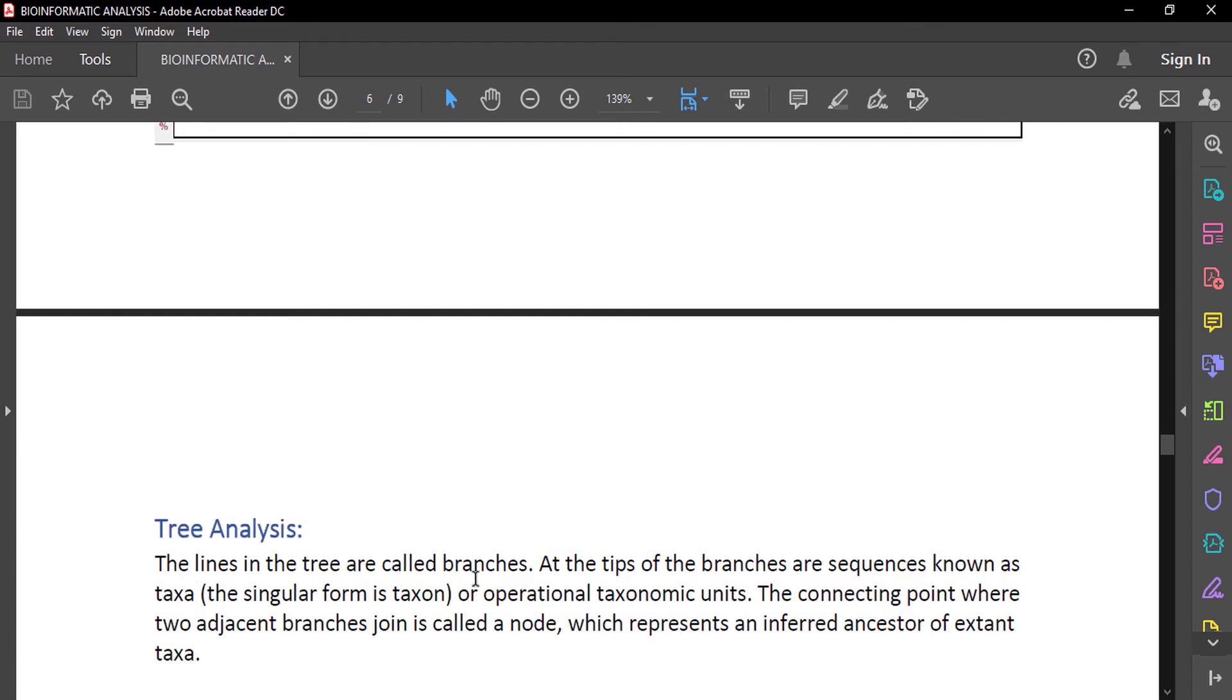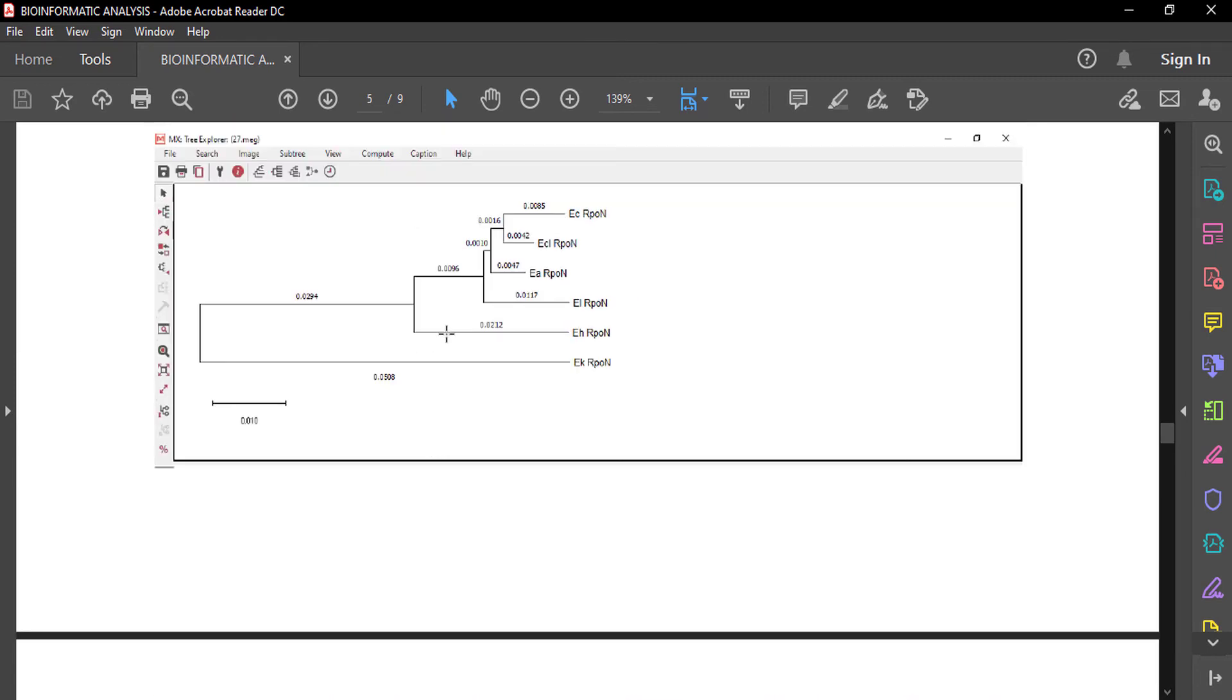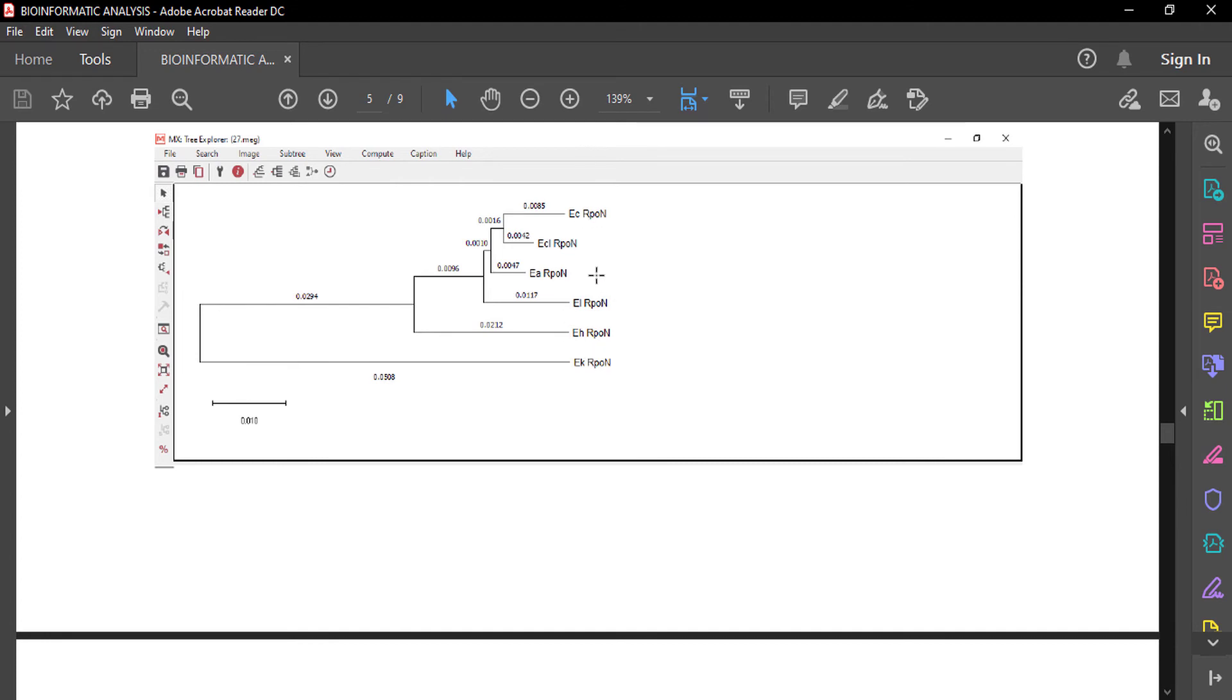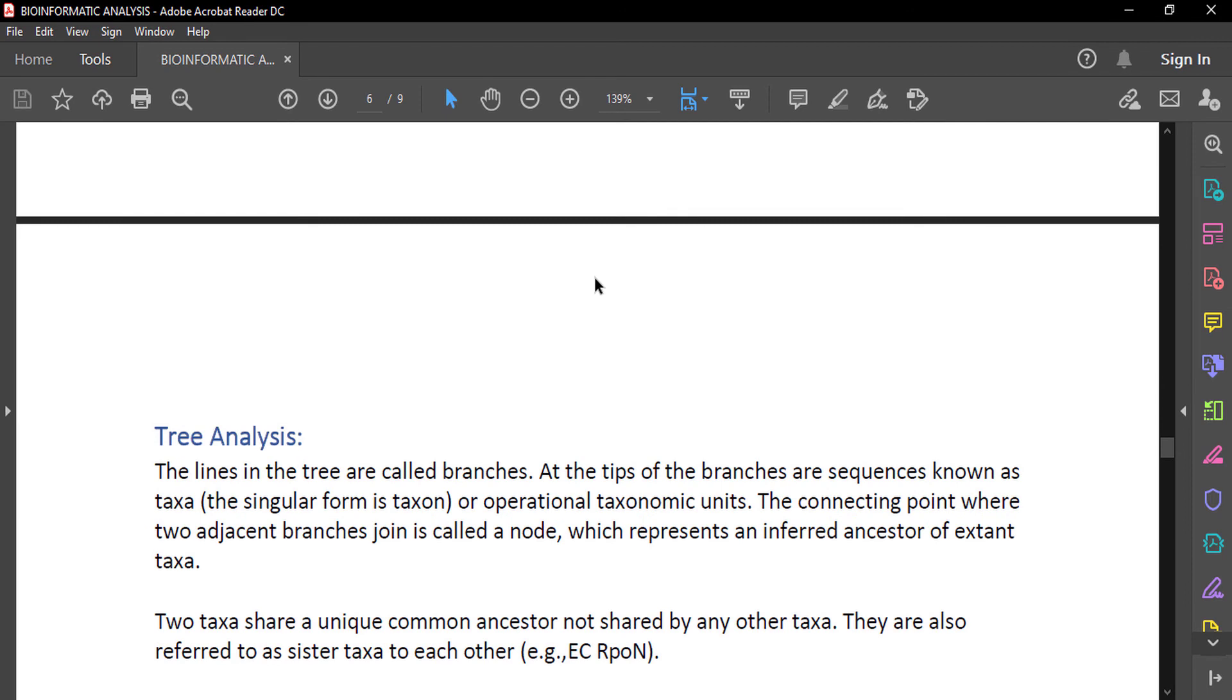The lines in the tree are called branches. At the tips of the branches are sequences known as taxa. These are the branches, and at the tip of the branch, these are sequences of protein that are known as taxa. The singular of taxa is taxon, or operational taxonomic unit.